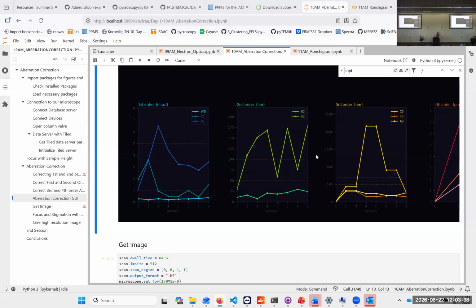With time, your coherence changes, so it's stable for some amount of time. The electron flies through your microscope in, I don't know, femtoseconds. So it has to be stable in that part for getting a good probe. But over time, you see this wobbling.